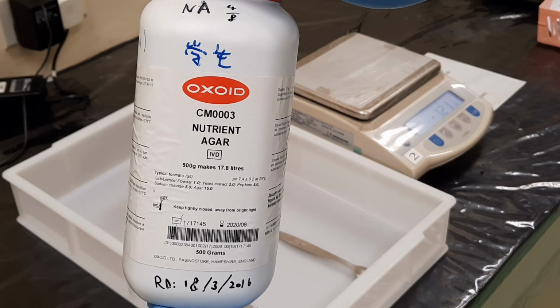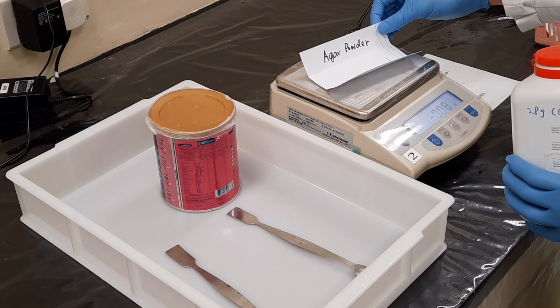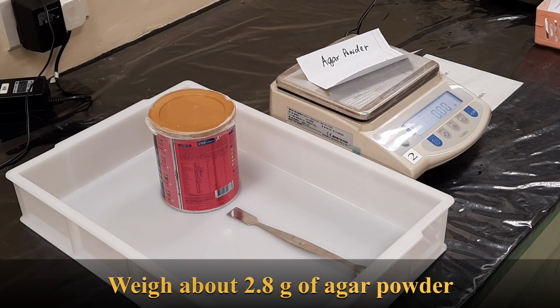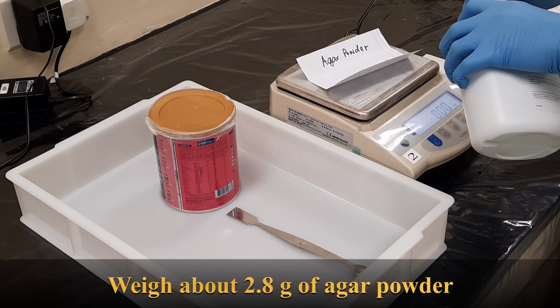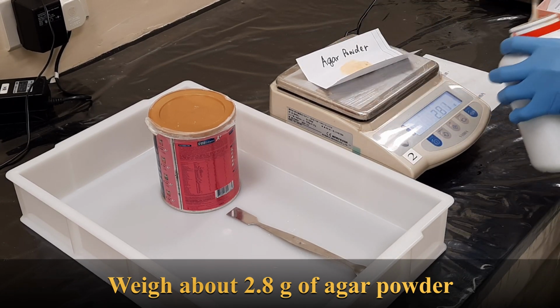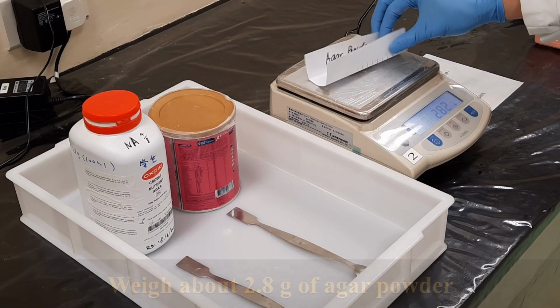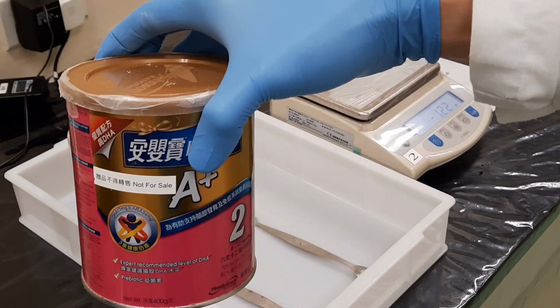This is the agar powder. Weigh about 2.8 grams of agar powder. And this is the milk powder.